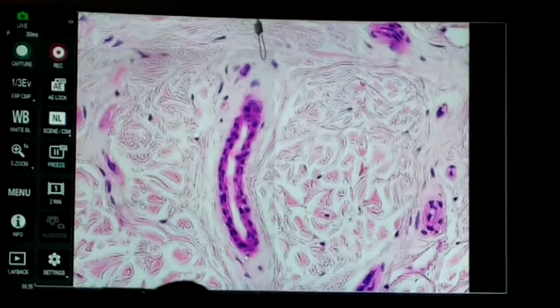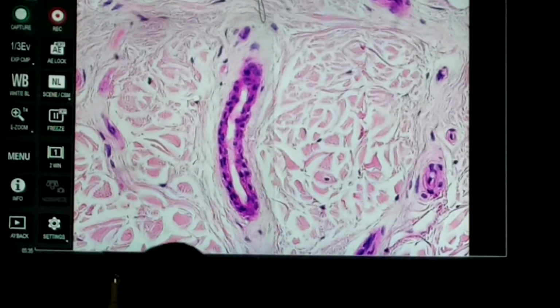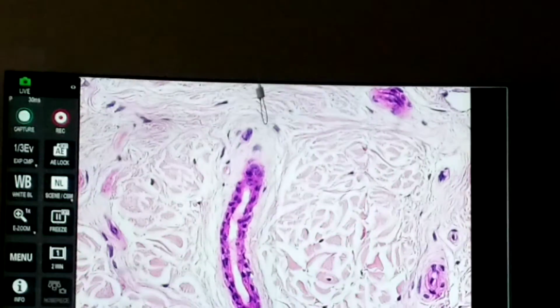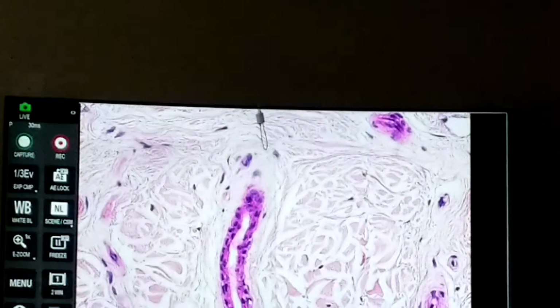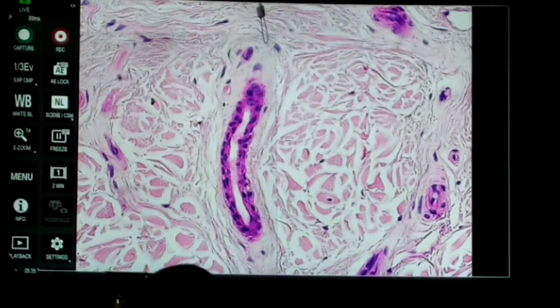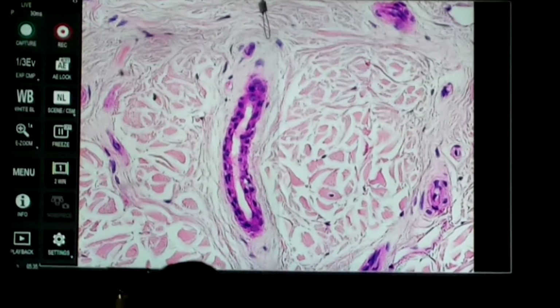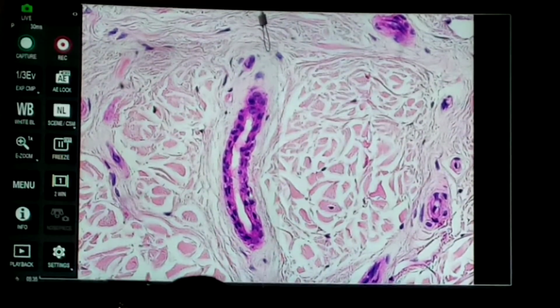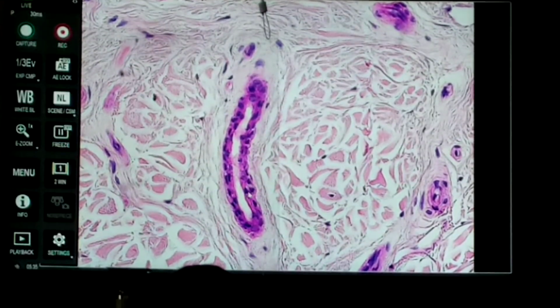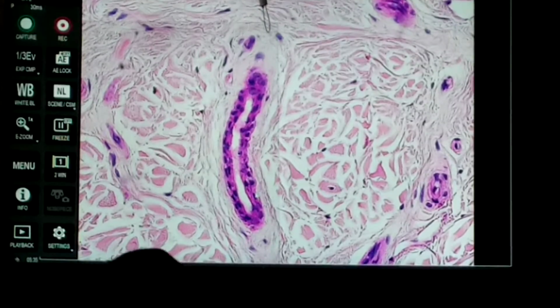Okay. And ducts of sweat glands are typically considered to be stratified cuboidal. Here's one cell, here's the next. They're not flat enough to be squamous. So this is typically your stratified cuboidal epithelium, which has 2 or at most 3 layers of cells. And so these ducts of sweat glands typically have 2 layers.